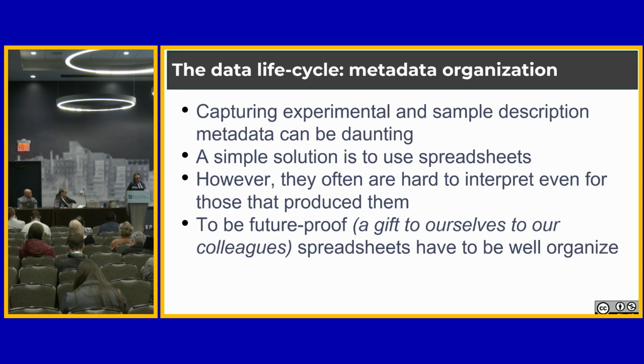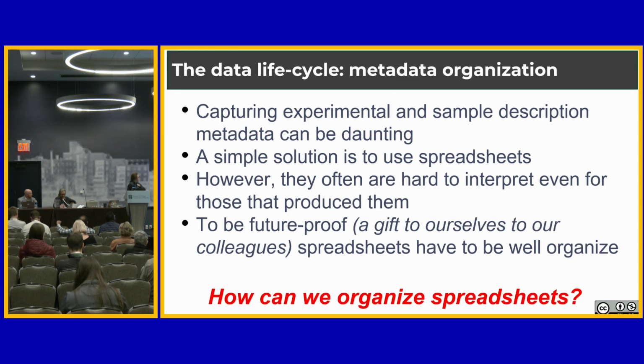So the idea of using spreadsheets is a good starting point for sure. All of us are using them anyway. They are very powerful, but the question is how do we make them more future-proof? Because they are often difficult to interpret, even by ourselves and definitely by people that might need to analyze our data. So how can we organize these spreadsheets so that they are more valuable for us and for others?